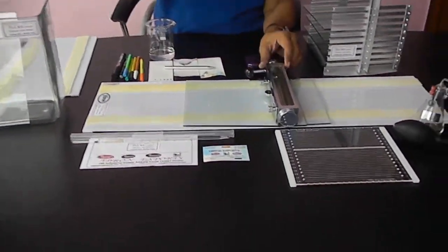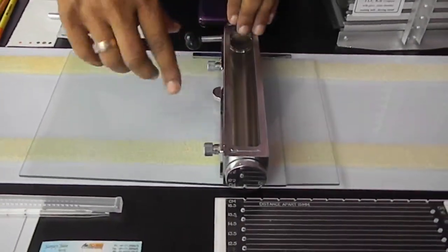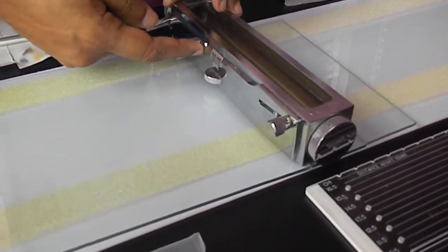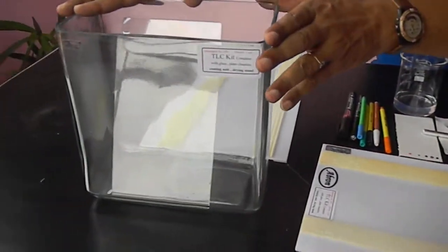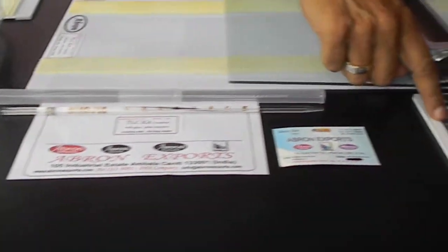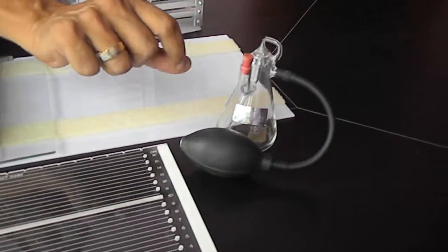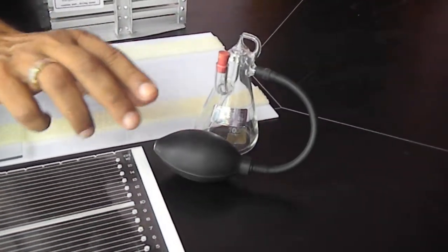We have provided this, you make a solution in this. There are some parts, this is for coating. There are adjustments. Here you can adjust the thickness of this. There is one glass plate and a chamber, a developing chamber. Then there is one pipette also provided. We have another plate for marking lines, etc. An atomizer for making a spray wherever plate coating is needed, and one drying chamber.